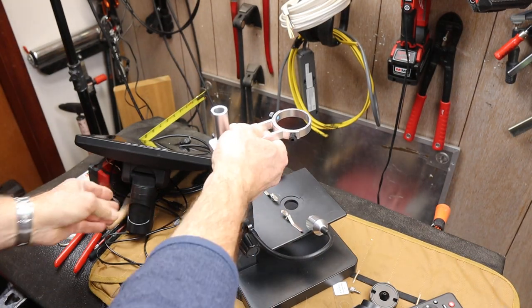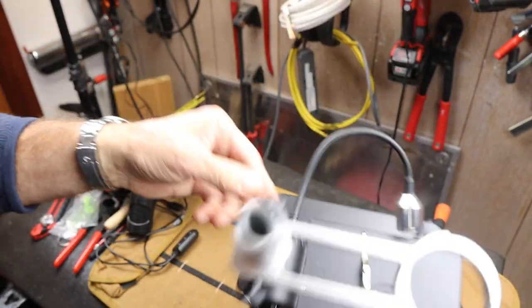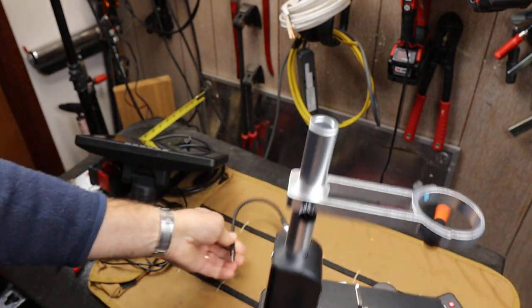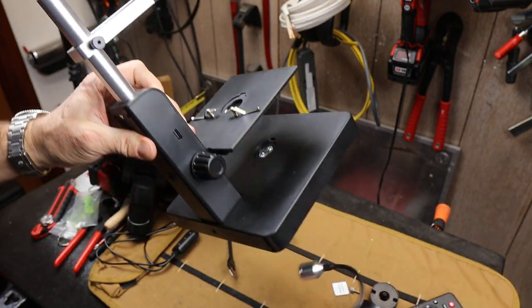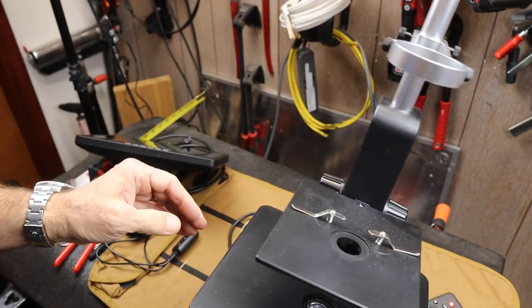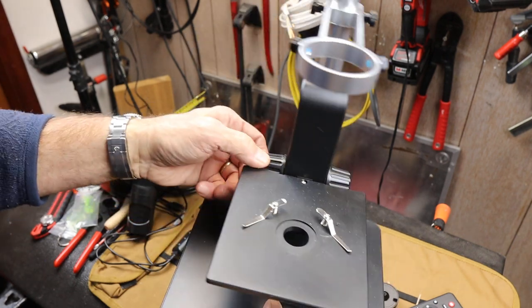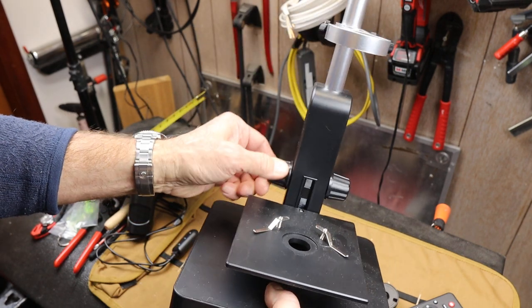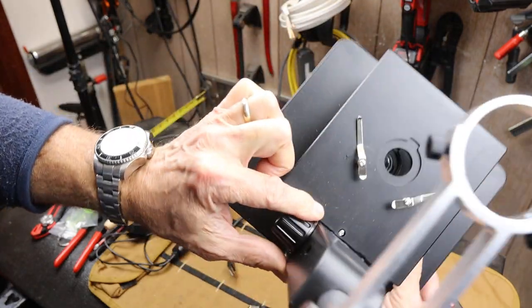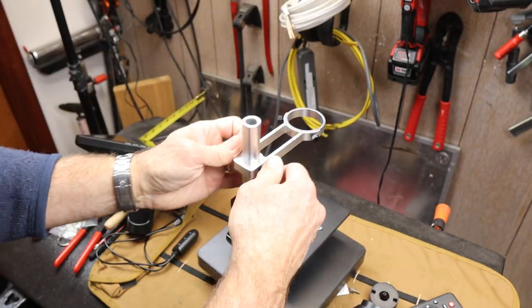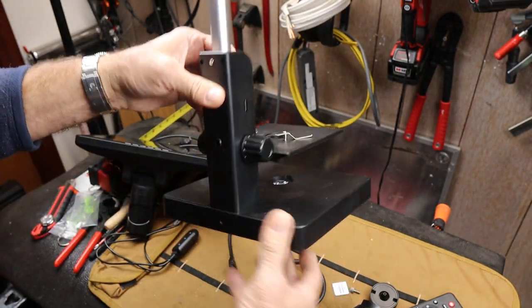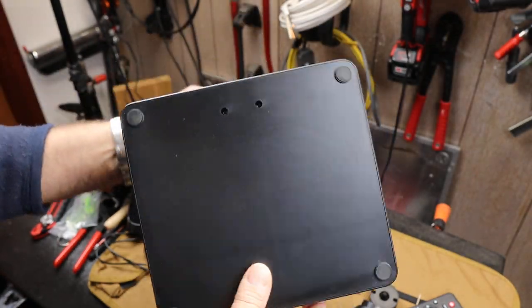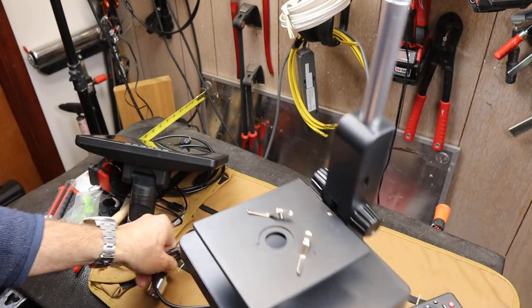And then here is the stand. Very simple design, very lightweight. The two USB lights just plug into the standard USB-A. So you could conceivably use some other kind of plug-in if you want. It's got two spring-loaded slide clamps. This right here is the extent of the movable stage, which is held on by one screw right there. It comes apart pretty easily. And then this whole aluminum collar just pops off, this slides out. And then the base is held on by two screws there. So it goes together quite easily.